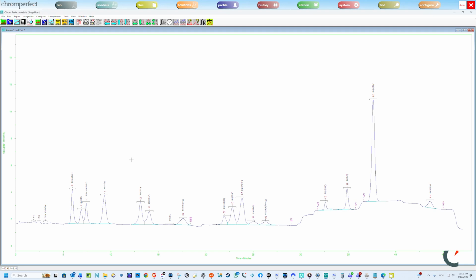Chromperfect is designed primarily as an automated chromatography data system. The objective should always be to refine the automatic integration parameters so that peaks are detected correctly without the need for manual adjustment. Manual integration tools are available when chromatographic conditions are imperfect or when unusual peak shapes require adjustment.